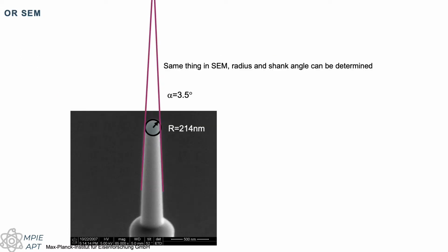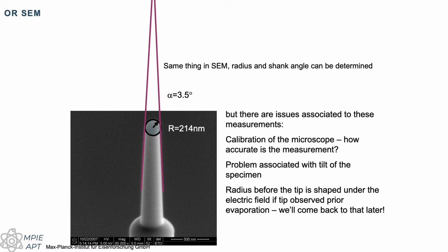And using the SEM, it can be even harder because there can be projection effects, and it's really not that simple. And there's also calibration issues with the SEM that might be a bit worse than on a TEM typically. So you have to be very careful to not take for granted everything that you think you're getting out of these measurements.